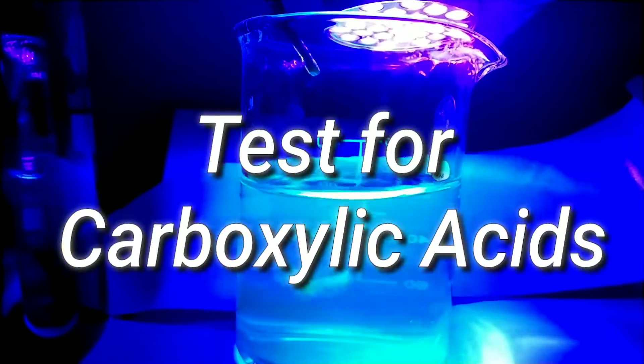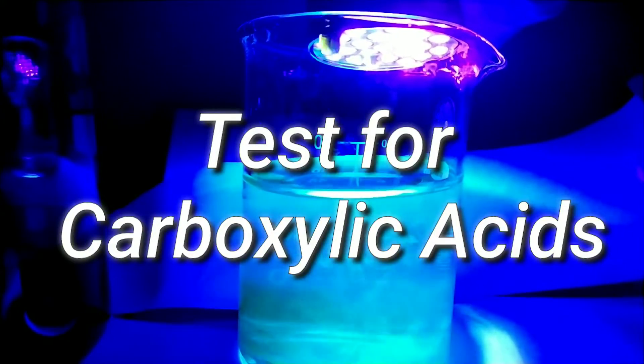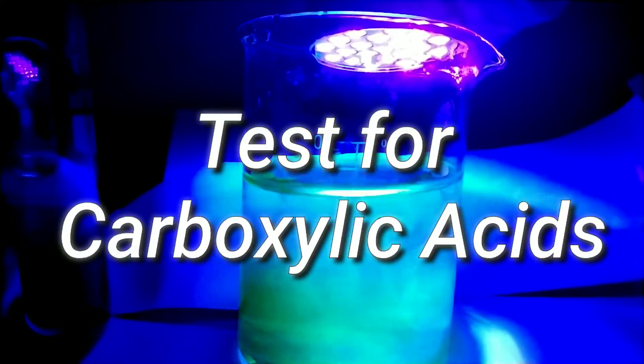The following video is for academic purposes only. It demonstrates the various tests for carboxylic acids.